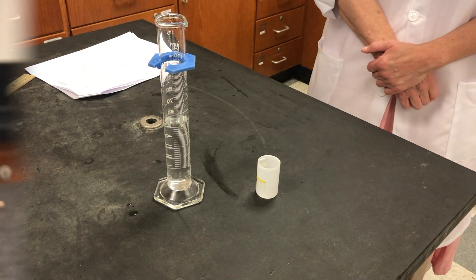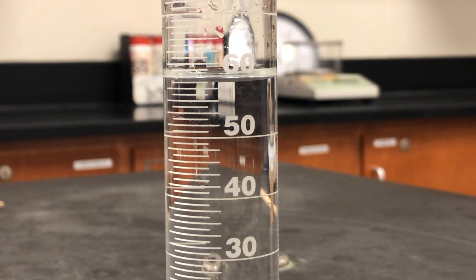Here we've filled a 100 milliliter graduated cylinder with water. Record the volume of the water in milliliters. Record the measurement to the accuracy of the graduated cylinder — that means estimate an extra digit beyond the smallest increment for proper sig figs.